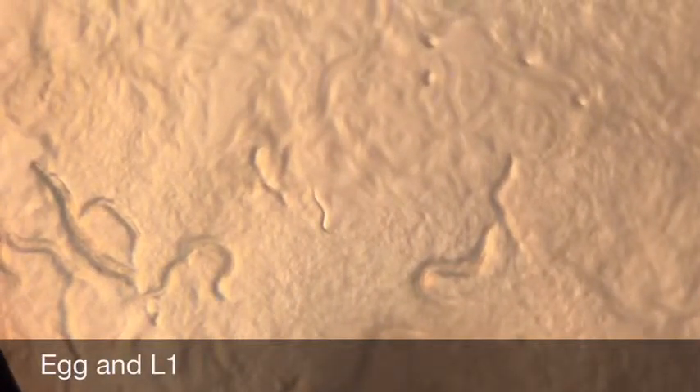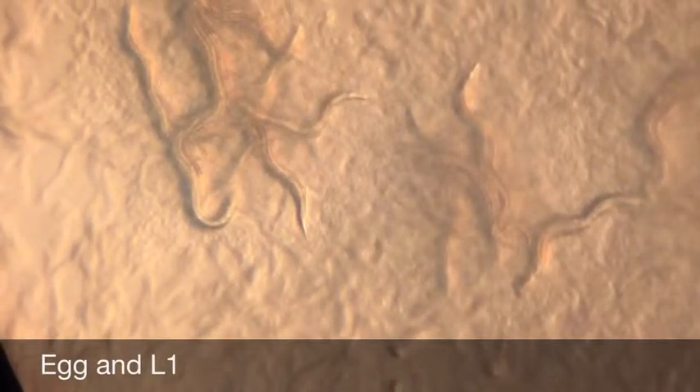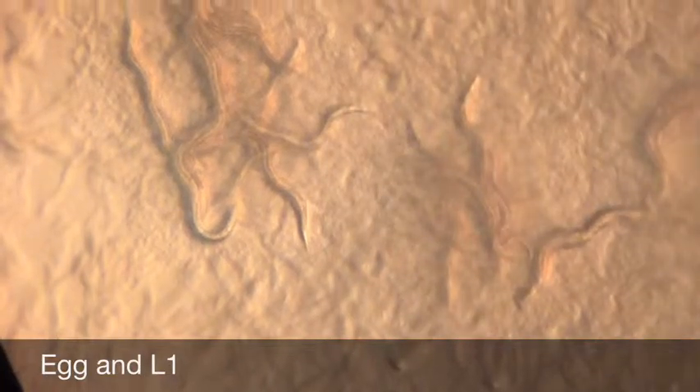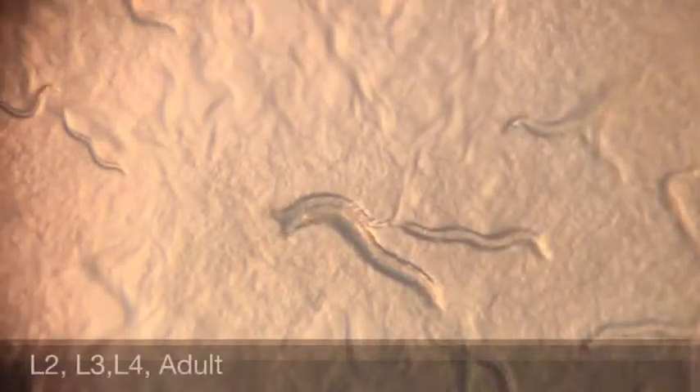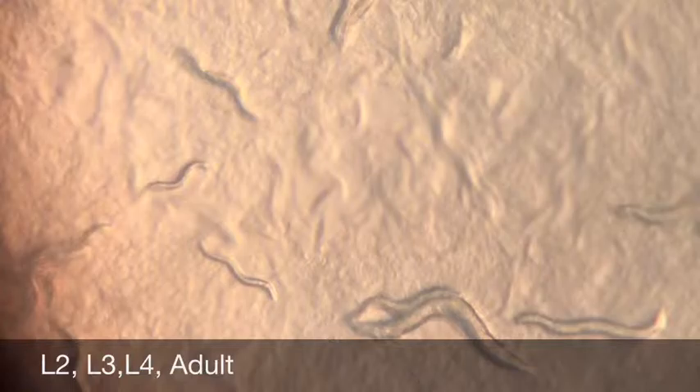This is the video of the first day of our experiment. These worms are all wild type worms, which means they have not had any genes turned off manually yet. This is an egg. Over here is an L1 worm, the first life stage after the egg. L2, L3, L4. L4s are nearly identical to adults, but they are slightly smaller and do not carry eggs, if they are female.